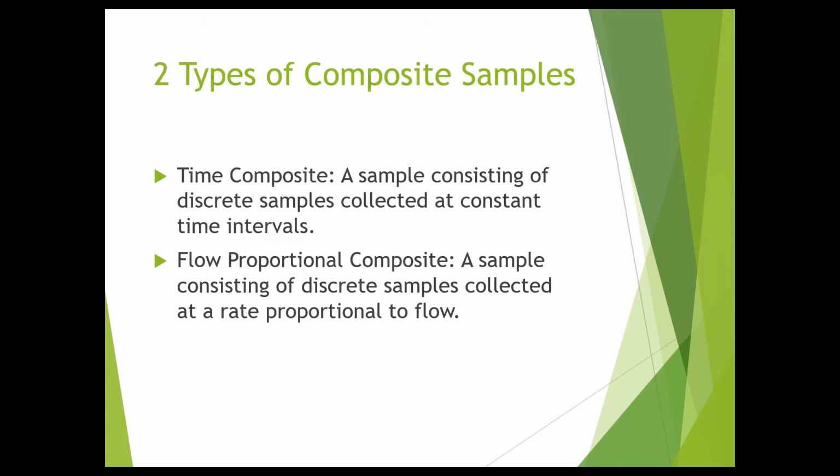So typically, when the EPA comes out, this is what we like to use. This is the bare minimum right here. So it works because you have a steady flow. You don't have wild changes in your flow characteristics. That's when time compositing works best.